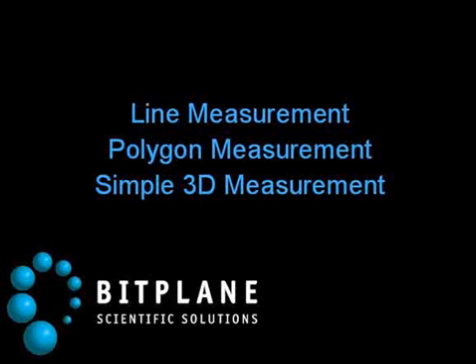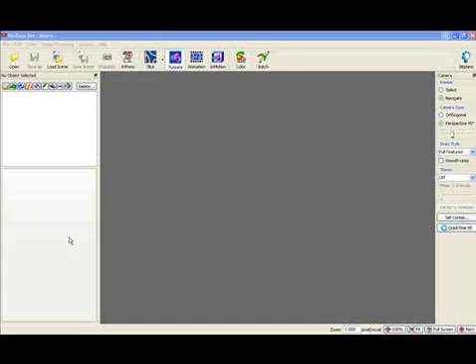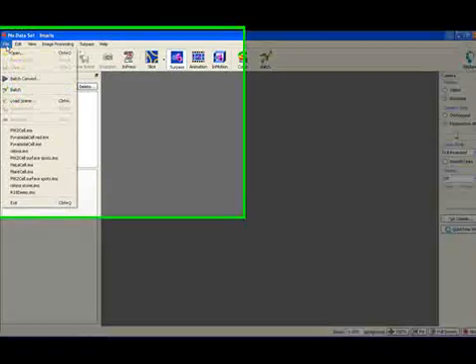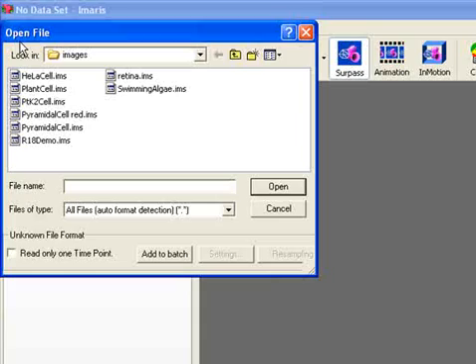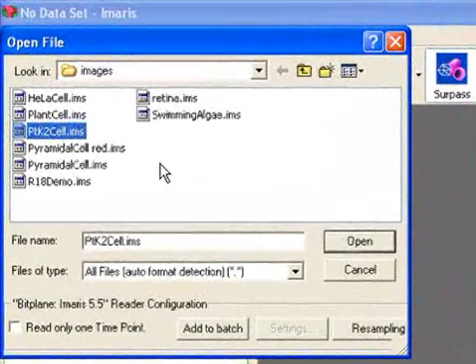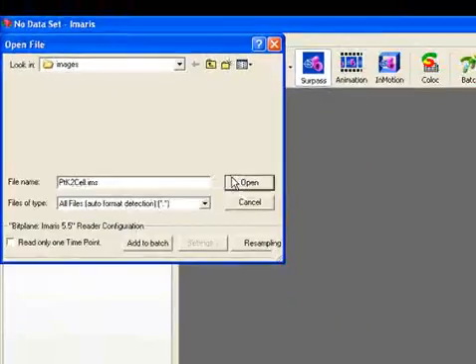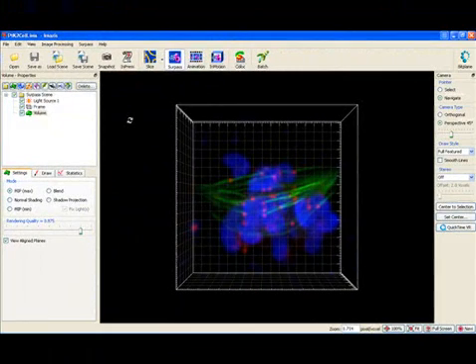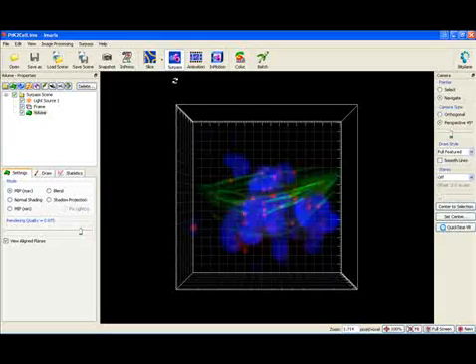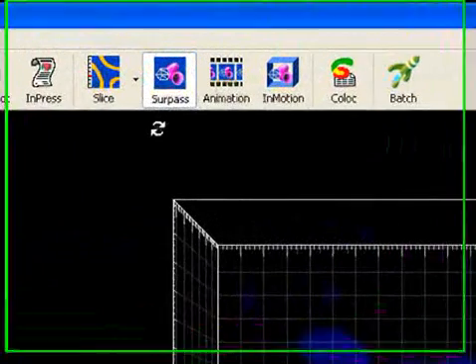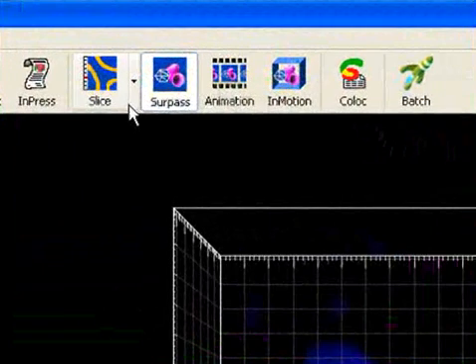This tutorial is focused on different measurement functions in the slice view. Open the image PK2 cell. Click on the button Slice to open the image in the slice view.